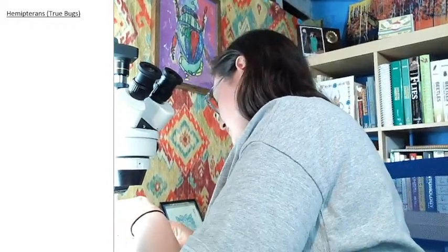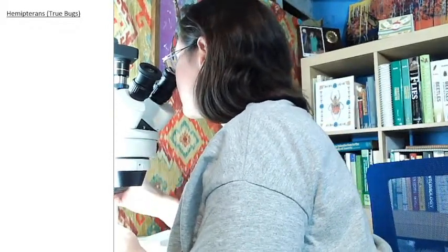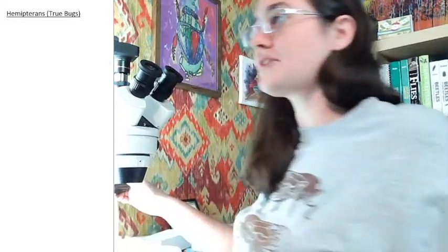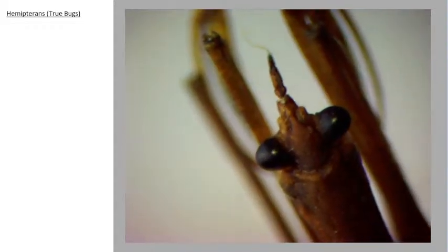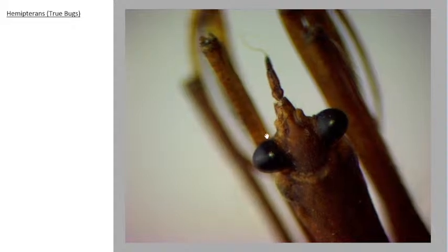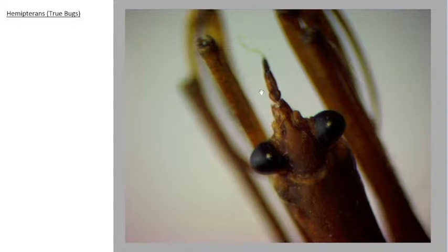I'm going to grab, let's see. Oh, you know what? The water scorpion has cool mouth parts that we can look at really quick. All right, so let me show you guys that. This is the head of a water scorpion. As we're looking at this head, you can see it has the two large compound eyes off the side, and then this, what looks like a beak, is a long predatory piercing and sucking mouth part.